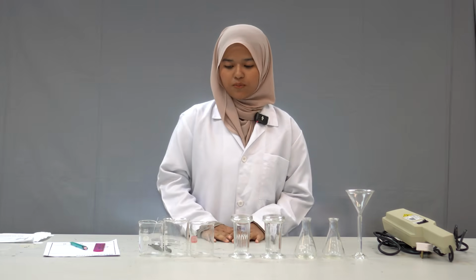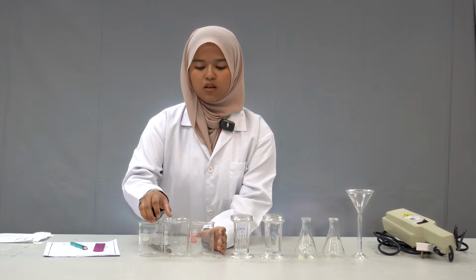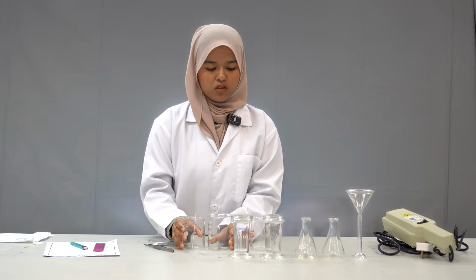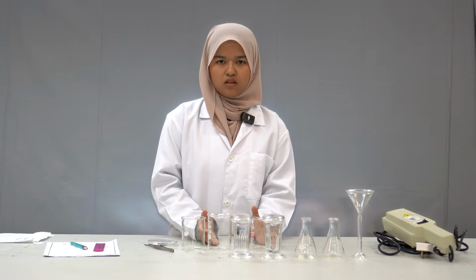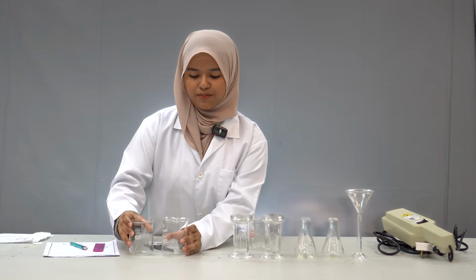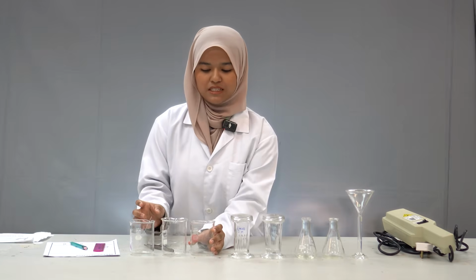Okay, thank you to Sister Sophia. Next, I will be presenting the procedure, result, and discussion. Firstly, for the procedure, we will start by preparing our three compounds: acid, base, and neutral. We will put a tiny amount of each compound in each beaker, then dissolve the compound with 5 ml of dichloromethane. Then we are done with the compounds.